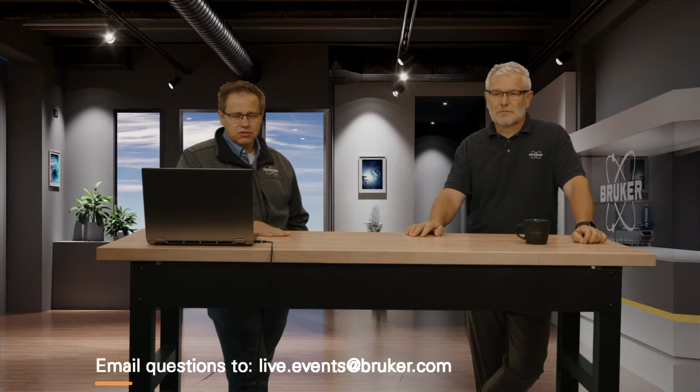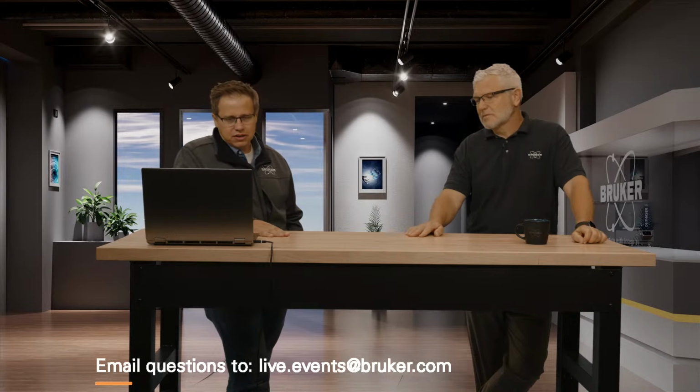The first question that came in the live stream is from Gustavo. Can the new plugin in Apex 5 suggest some author response for CheckCIF?